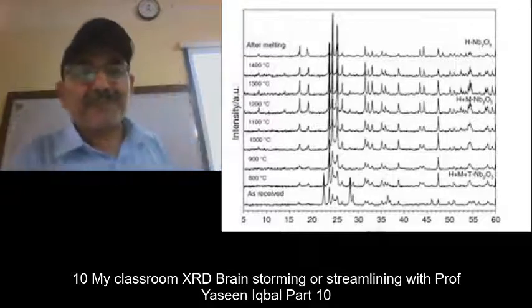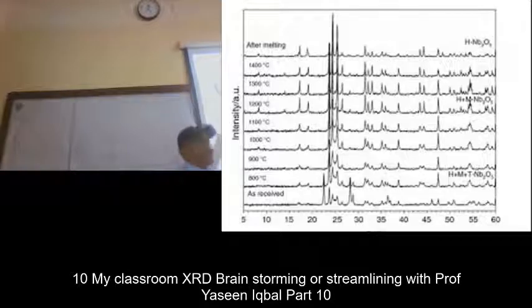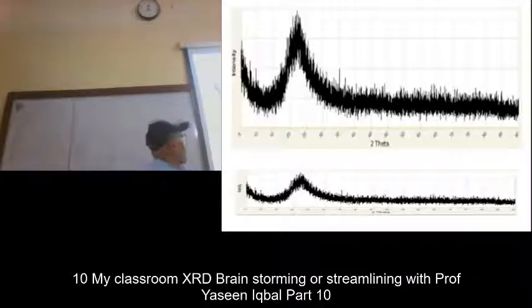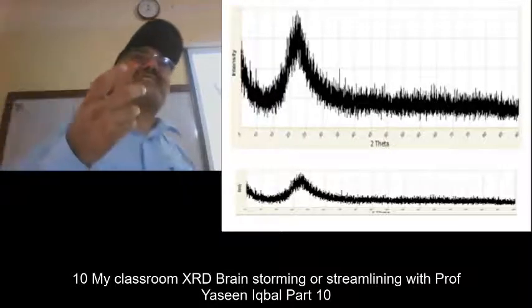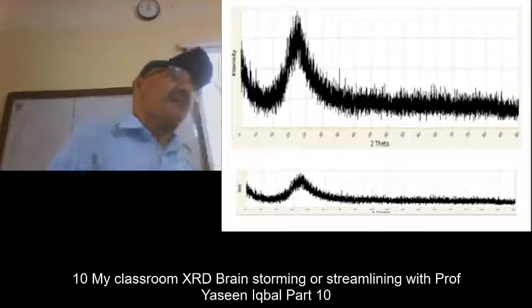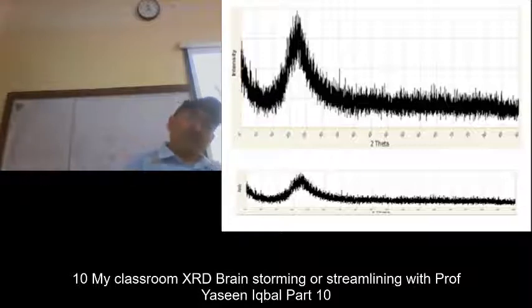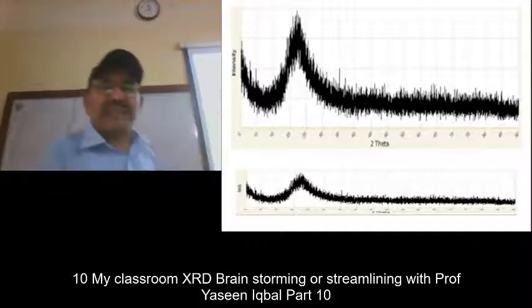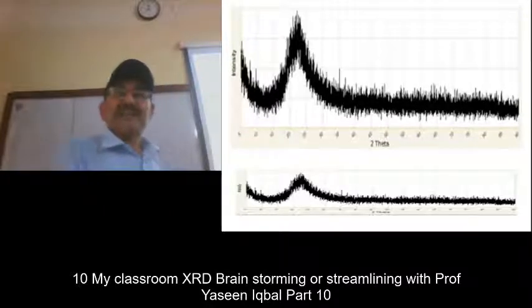If the material is glassy, it is like this. These are the same patterns, but I squeeze this and I blow that up, and you see how many spikes and things like that. So you organize the data into a presentable manner, but you must not conceal any information which was visible. So the peaks are not hidden.